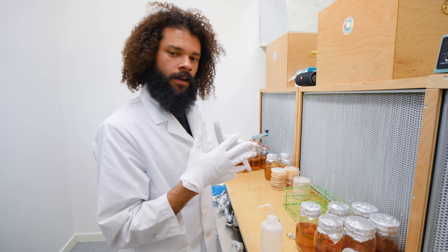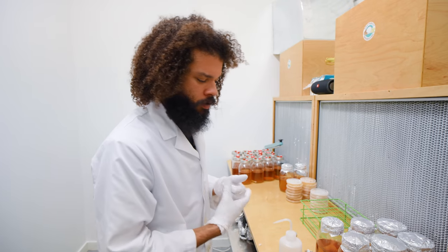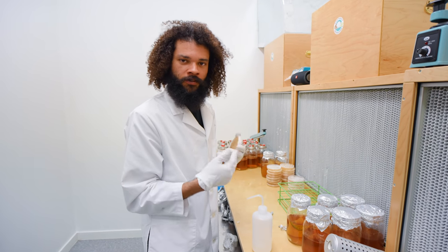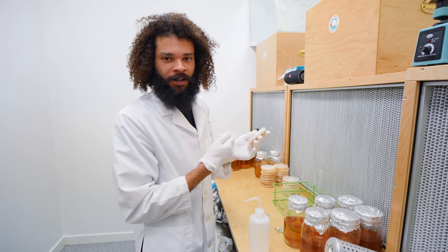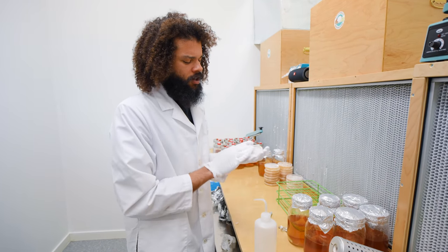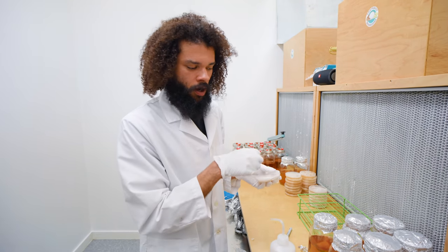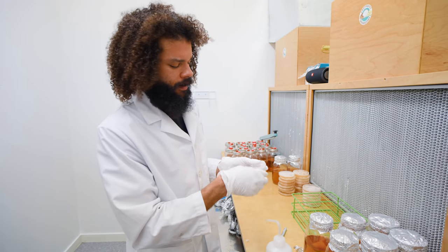I just put some extra gloves on because I had a hole at the tip of my glove. Instead of taking off the glove and putting on new ones — my hands get sweaty and it gets hard to put gloves on — I just put gloves on top of those gloves and they slide right on. That way I don't have to break a pair of gloves trying to get them on. These are vinyl exam gloves, which tend to crack and break easily, especially at the fingernail area.